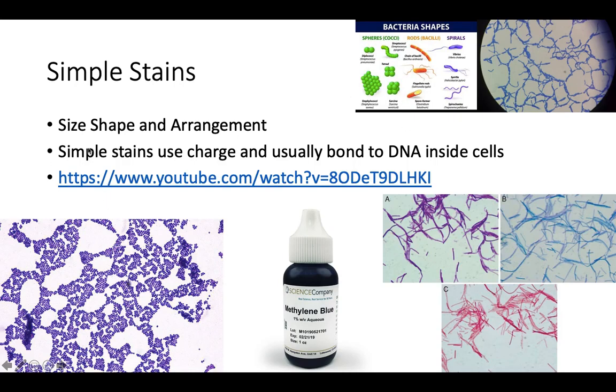So the way that the bacteria are arranged is going to be very helpful for diagnostic purposes as well. So you get size, you get shape, and you get arrangement with a simple stain. The only problem here is you do not get gram reaction, which is the whole point of this. This is a useless stain for diagnostic purposes. This is a quick down and dirty, I just want to see what it looks like underneath a microscope. You do not want to diagnose anyone with a simple stain.